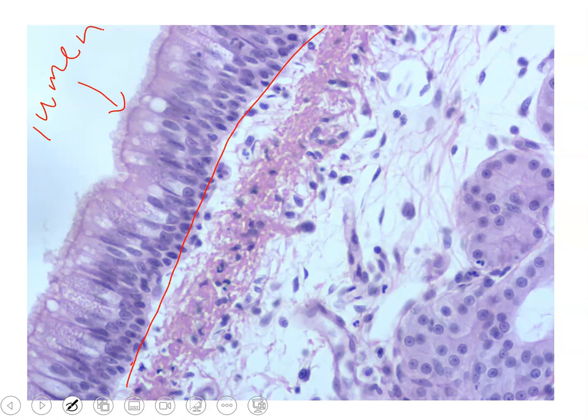So we say that this is a pseudostratified columnar epithelium because pseudo means fake, but we know the cells are actually columnar cells that all attach to the basement membrane. And it's just that not all cells can reach the surface, but it's still considered one layer. And again, the nuclei at many different levels giving off that fake stratified appearance.